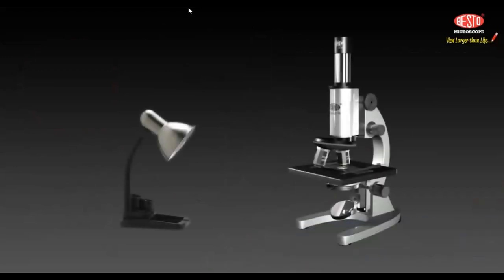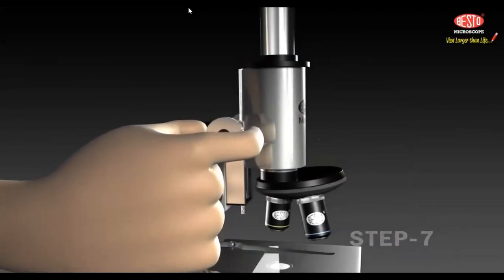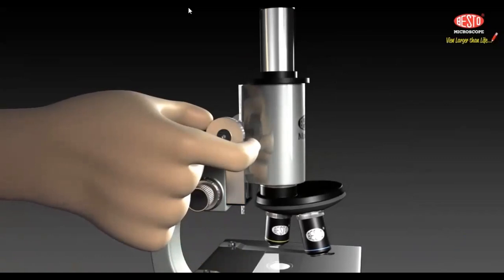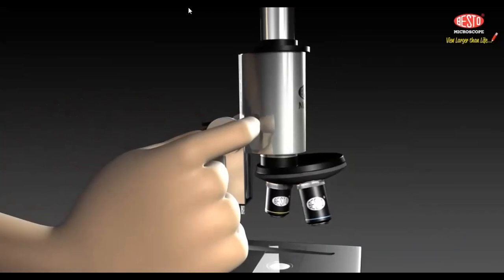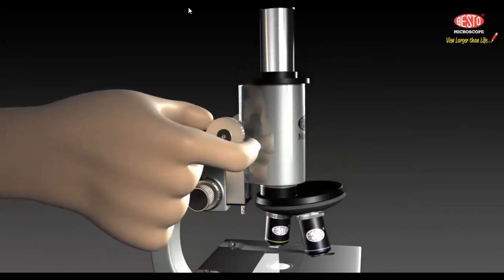Step 6. If you are using a lamp for your lighting, put it about 20 centimeters away from the microscope. Adjust the lamp so that the light points towards the mirror under the stage. Step 7. We have already told you in step 2 that the low power objective is in place over the hole in the stage. Look through the eyepiece and use the coarse adjustment knob to focus upwards, moving away from the sample or slide. This should bring the slide or sample into view. If you go too far, simply begin again at step 2.